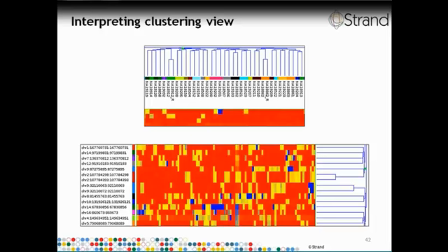Another question people typically have when carrying out Amplicon sequencing is whether all the Amplicons have been covered at sufficient depth in the experiment. For instance, we have 364 different Amplicons. The first quality check to carry out is to see do they have at least 50 reads covering each of the Amplicons in a majority of the samples.